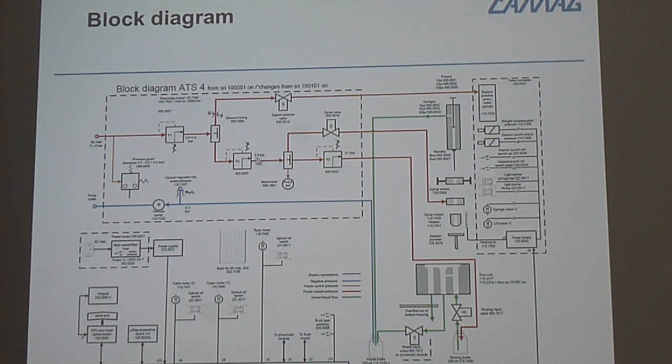And we're also splitting, and then we have here reducing again. 0.1 bar goes directly to the rinsing bottle, and the other spray valve is controlling the spray application directly to this ring, which goes directly to the nozzle.